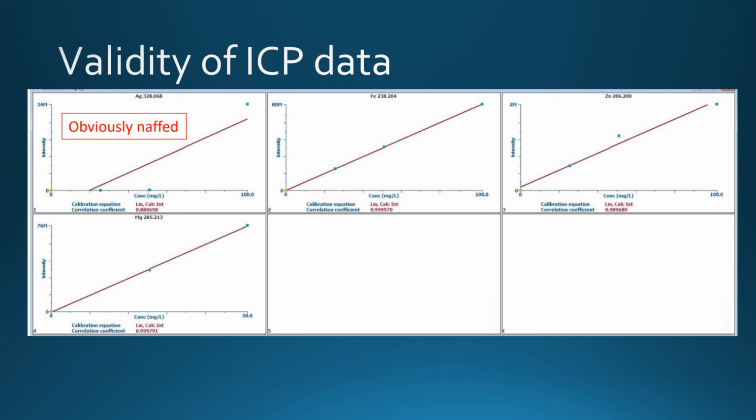Moving on to zinc, however, we do see that there is a little bit of wonkiness going on here, shall we say. Our coefficient is 0.98, as we can see there, so there will be some uncertainty with this one as it wasn't quite calibrated correctly. So the molarity that we worked out previously for this one should be taken with a pinch of salt. It's still close enough to be pretty accurate on roughly what the concentration is, but it's not perfectly accurate, I suppose.